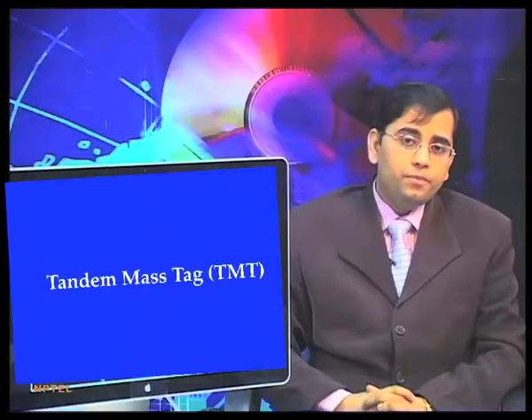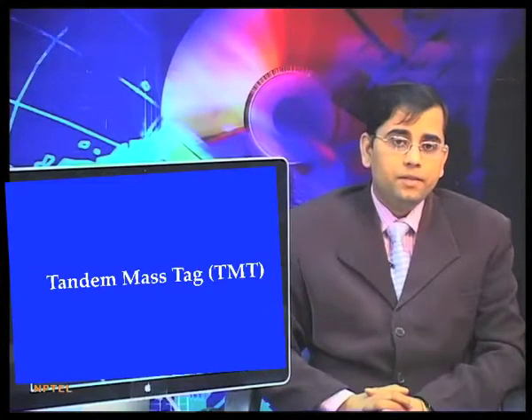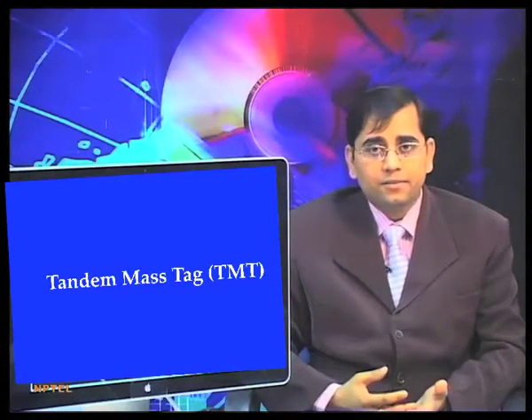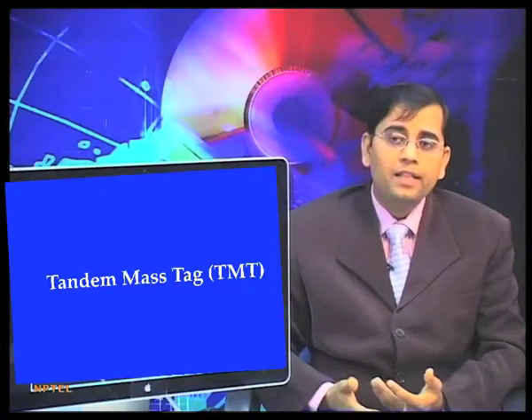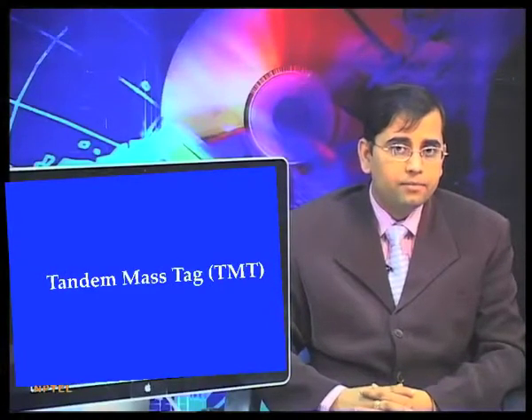Now, let us talk about tandem mass tag or TMT. This method is similar to the iTRAQ which we just discussed. TMT is also an MS-based quantitative technique which uses isotopomer labels referred to as tandem mass tags. It also provides accurate quantification of peptides and proteins.